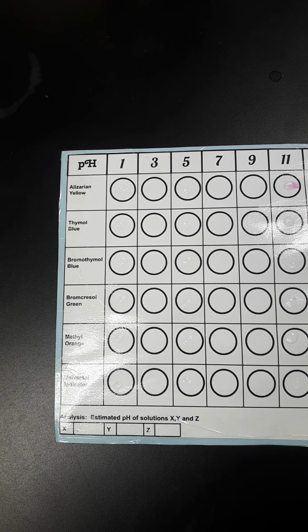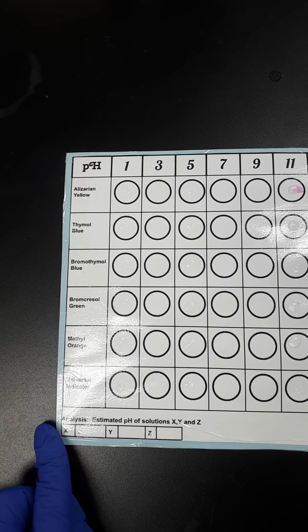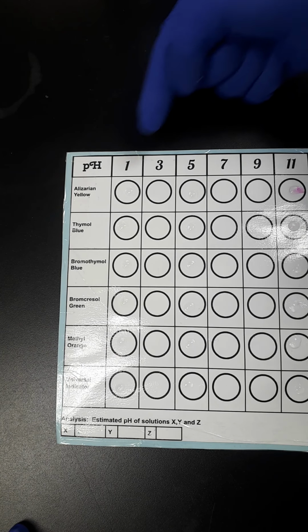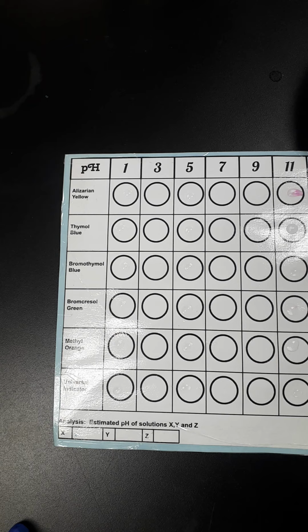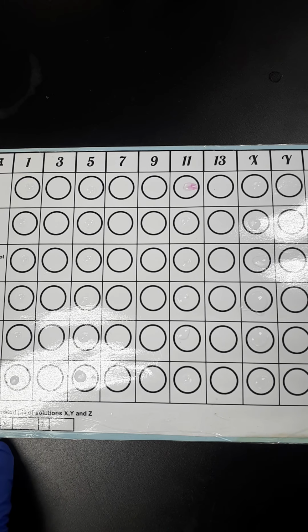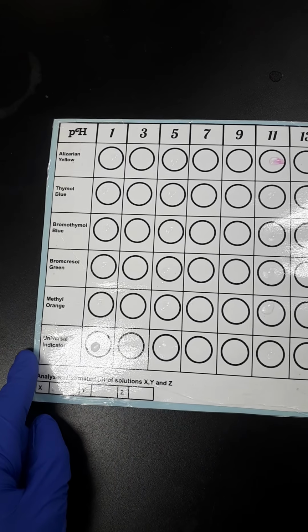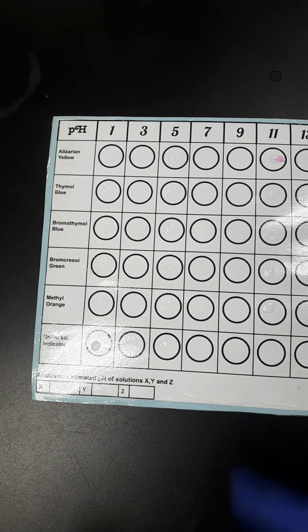So, we've got our lab set up here, and I'm only actually going to do parts of these labs. So I'm going to do pH 1, 5, 11, and then I just have to gently move this over. And we're going to do an unknown. So we'll see what each of the colors look like in each of those, and then we'll try and figure out the approximate pH range of the unknown.